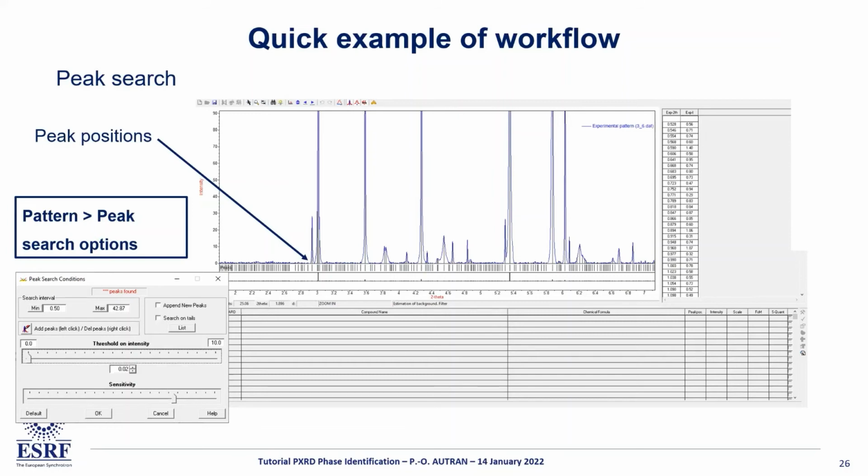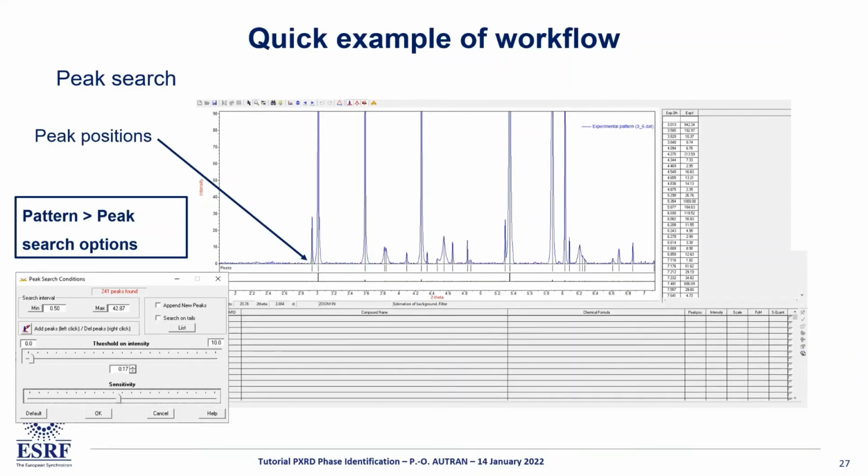So what I tune now is I'm going to increase the threshold and the intensity as well. Since I increased the threshold, I can tune the intensity to match the peaks. And you see here, now all the peaks I want to be identified, which have a meaningful value, are there, meaning I will be able to input that in the software. So this is the key, the important step. If you manage to achieve that already, you're in a very good way to identify the phases.